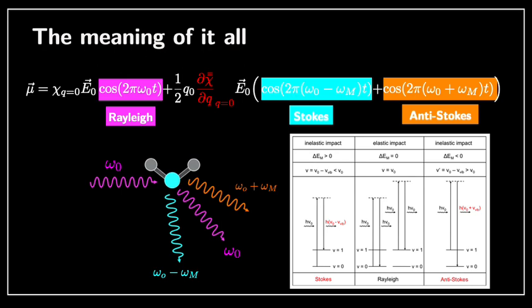This is a very interesting thing because of course you can have vibrations simply due to the equipartition theorem at finite temperature. So the anti-Stokes would actually be able to pick up that. Now it's interesting to see that usually the anti-Stokes and Stokes signals are symmetrical, but you can also use the difference between anti-Stokes and Stokes as a thermometer.